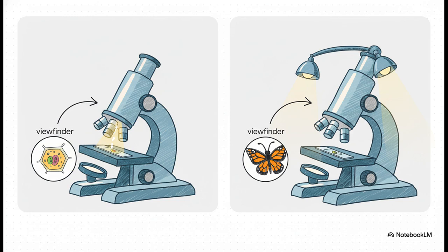Okay, so here's the absolute key difference, and it's pretty simple. The compound microscope is for looking through things. Think about it, like thin slices of onion skin or living cells swimming around in pond water. Stuff that light can actually pass through. It gives you this massively magnified 2D view inside the sample. But the dissecting scope, that's for looking at the surface of things in glorious 3D, like the totally alien-like texture of a beetle shell. So one looks inside, the other explores the outside.